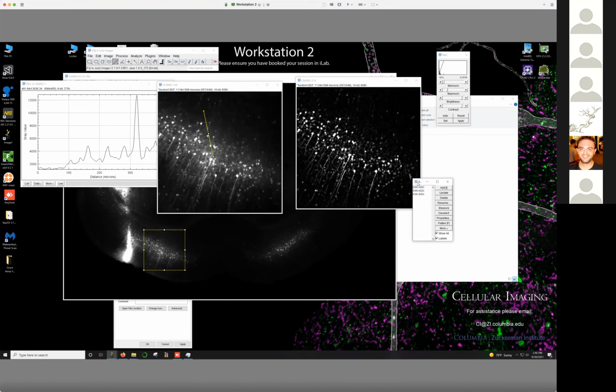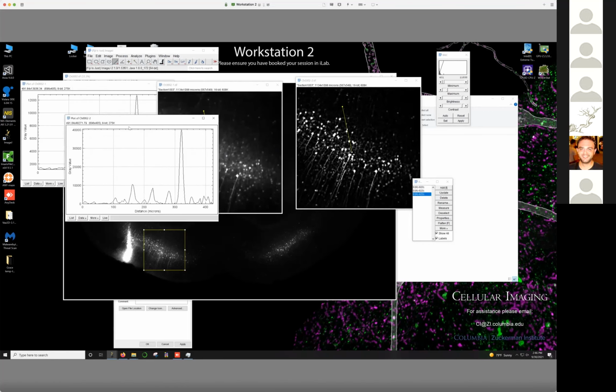you can add these just by pressing T, which adds a region to a list. Then when you click on another image, you can add this in on another image. So that's a nice way of copying regions. I can now plot that again, and you see really well here what it's done.